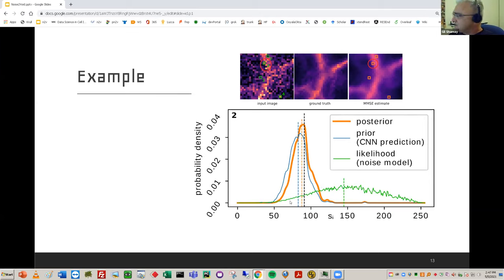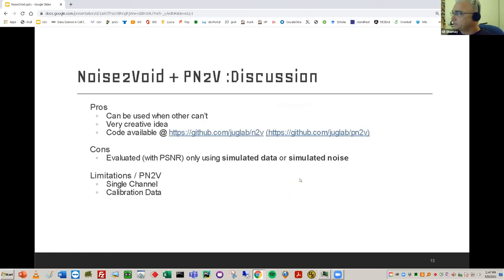In green, we see the distribution of the noisy model and the input pixel, and in orange we can see the distribution of our model and its prediction, and in black we see the ground truth, which we see is very close. Those are very close to each other.